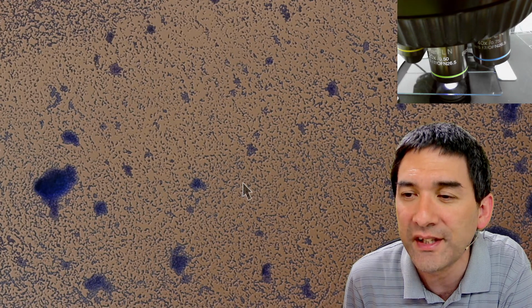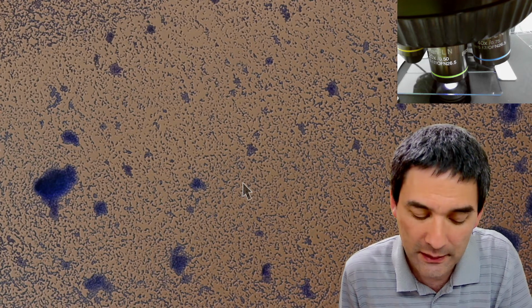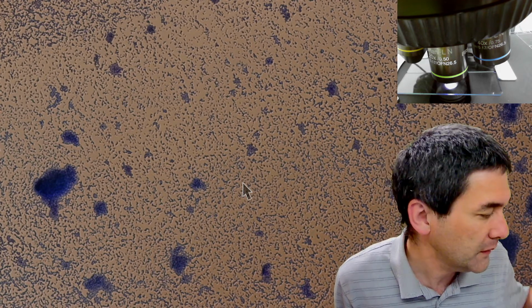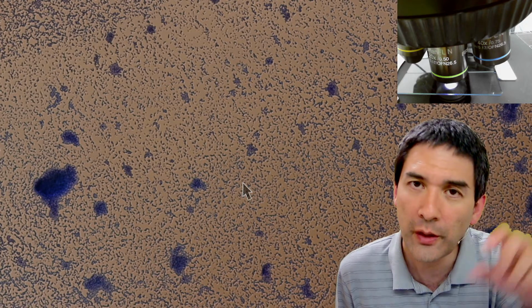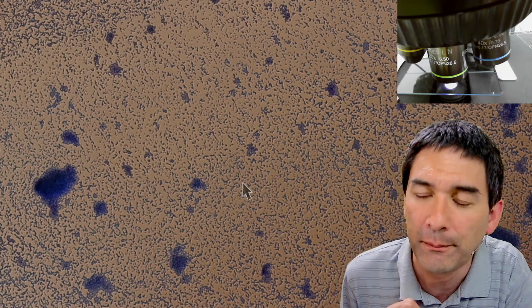Have you ever done fluorescence microscopy? Yes, at university. And a little bit also at home, experimentally, where I tried to make things glow by shining a UV flashlight on the sample.